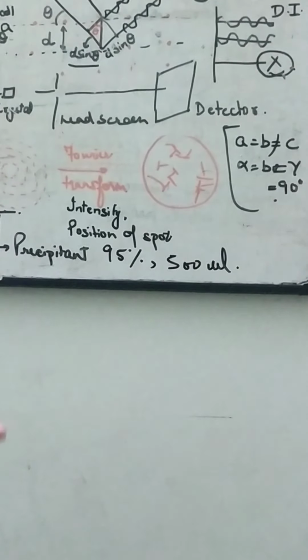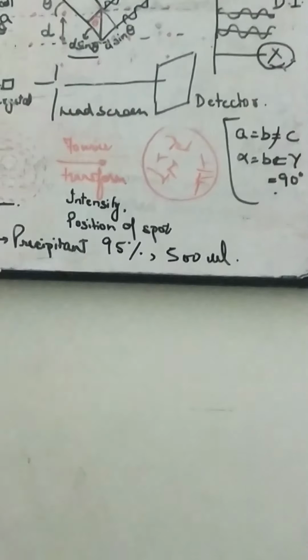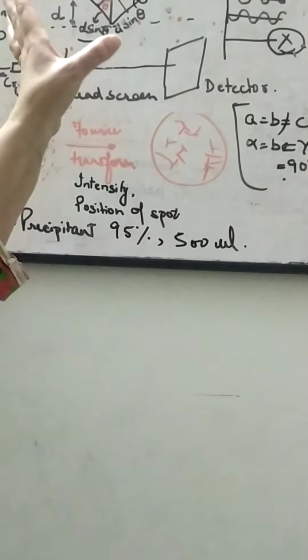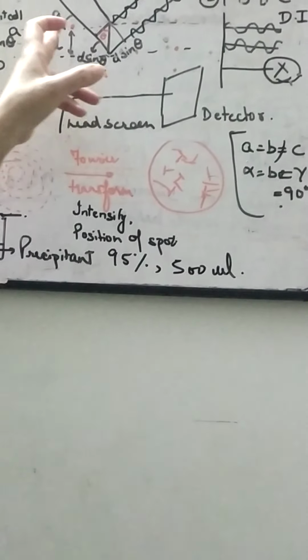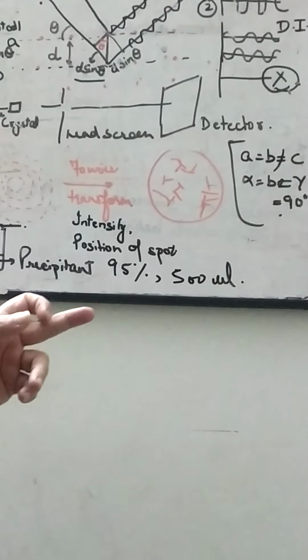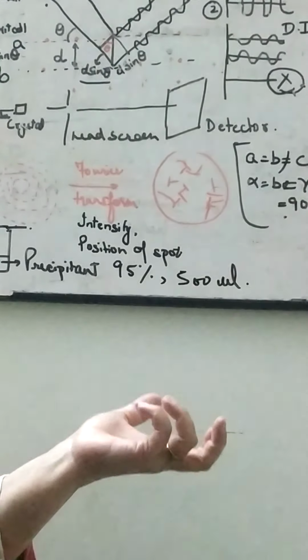because at least some crystals should be there which can be placed in the apparatus and the X-ray crystallography can be done. Now, once we have obtained the crystal, the crystal is placed on a device which is known as a goniometer. Now, what is a goniometer?